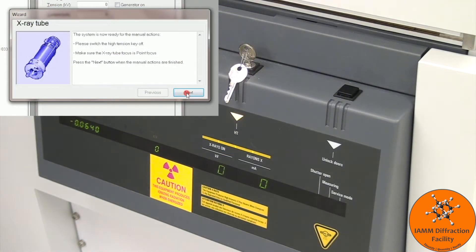We see that the screen says to turn off the high-tension key so we will rotate that so that the light turns off. It then says to make sure the x-ray tube is in point focus.